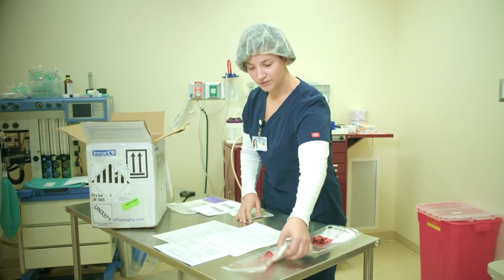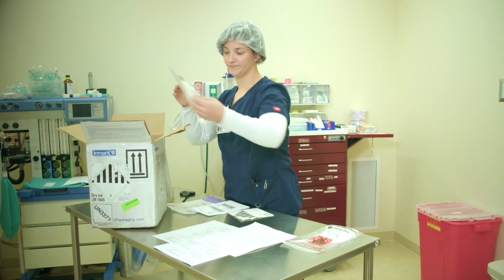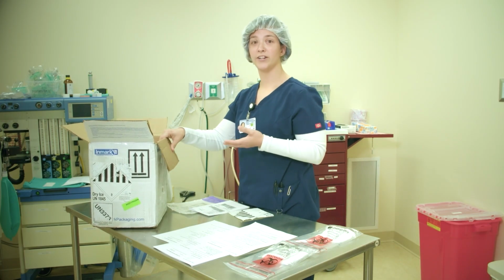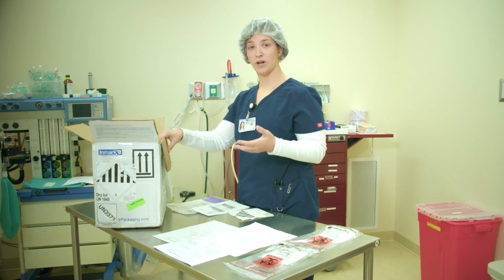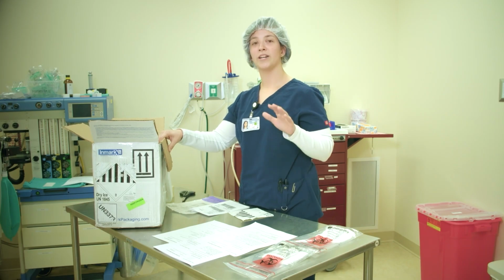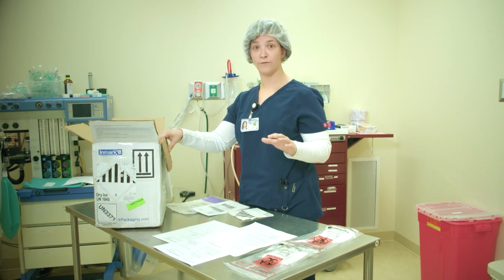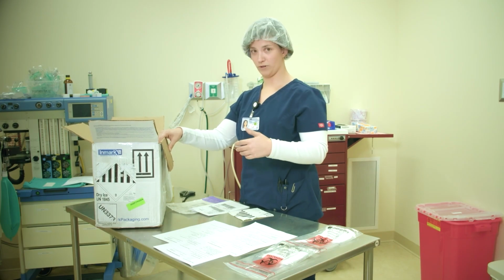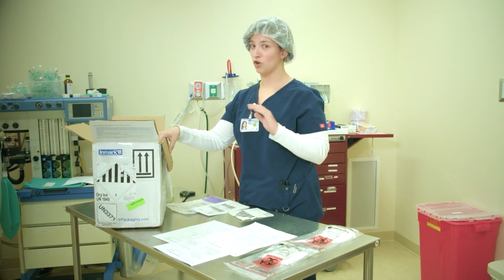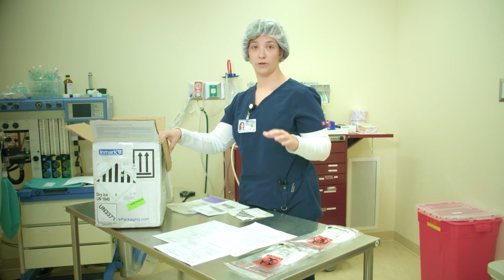Once you have all of your samples in a bag, you can place it on dry ice in the box. The box I have here has styrofoam in it to keep dry ice, and it will keep all of your samples frozen. Make sure you put enough dry ice in the box that the samples will remain frozen during transport. This, I recommend, is no longer than 24 hours. Send your samples overnight.